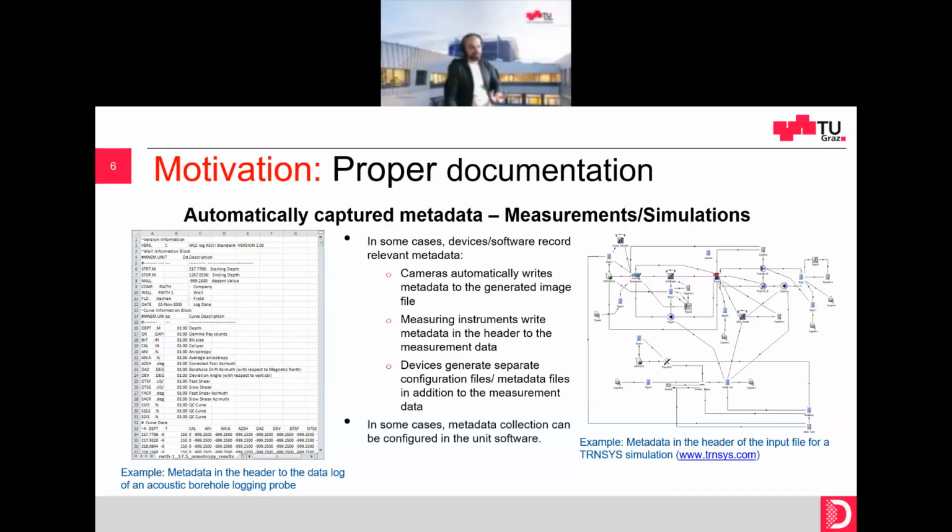So these are all things that are actually available for you. Sometimes you also have the possibility to configure this stuff, and sometimes you have to trigger it yourself. In these cases, it's already available; sometimes you have to configure things and then actively trigger it to get it. But it doesn't matter. In all of these cases, it has to be stored somewhere.